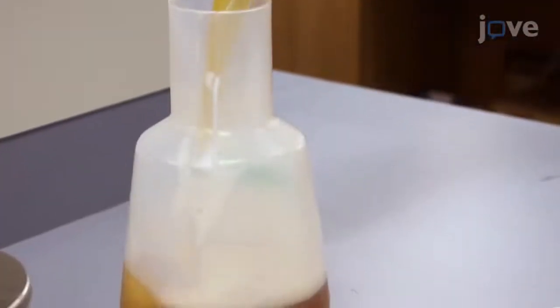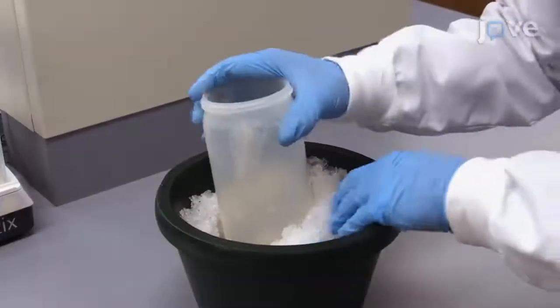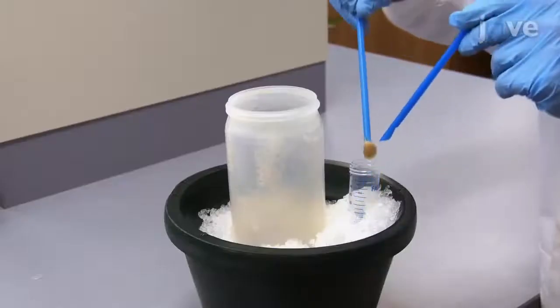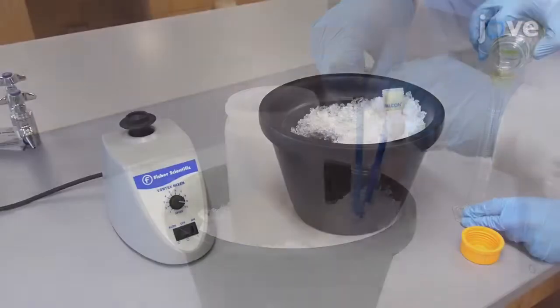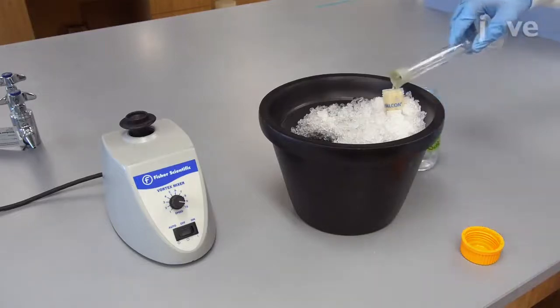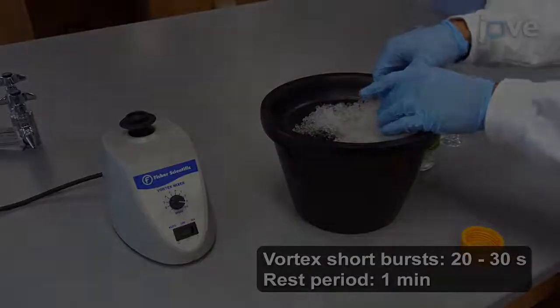After this, slowly pour off and dispose of the supernatant. Place the cell pellet on ice. Using a sterile spatula, scrape the cell pellet out of the centrifuge bottle and transfer it to a cold 50-milliliter conical tube. Add 30 milliliters of cold S-30 buffer supplemented with 2 millimolar DTT and re-suspend the pellet by vortexing in short bursts.